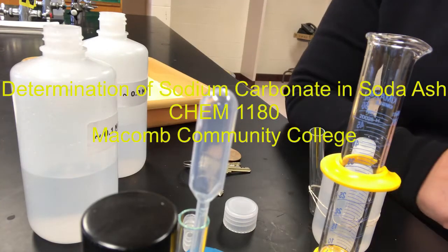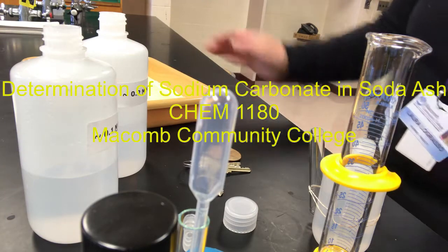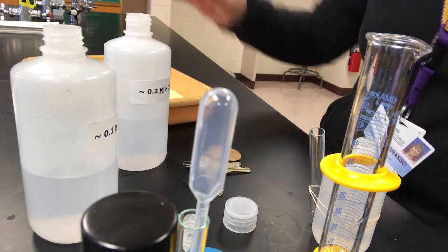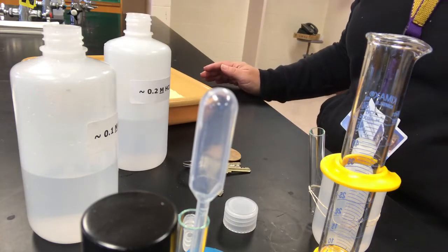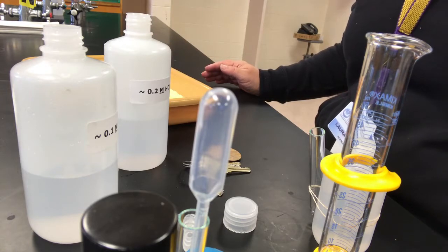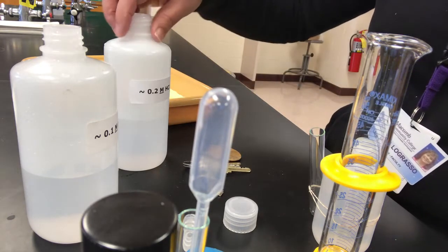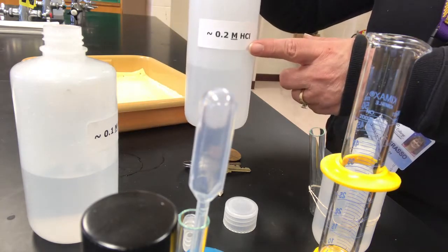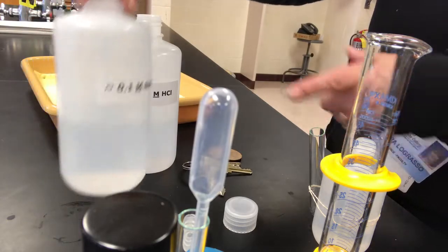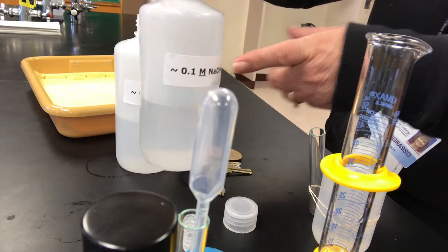Welcome to determination of soda ash. So in this experiment we're going to be using hydrochloric acid to titrate some soda ash and determine the quantity of sodium carbonate that's in the soda ash sample. We're going to have to determine the concentration of the prepared hydrochloric acid by titrating it with sodium hydroxide. But we also have to determine the concentration of sodium hydroxide.